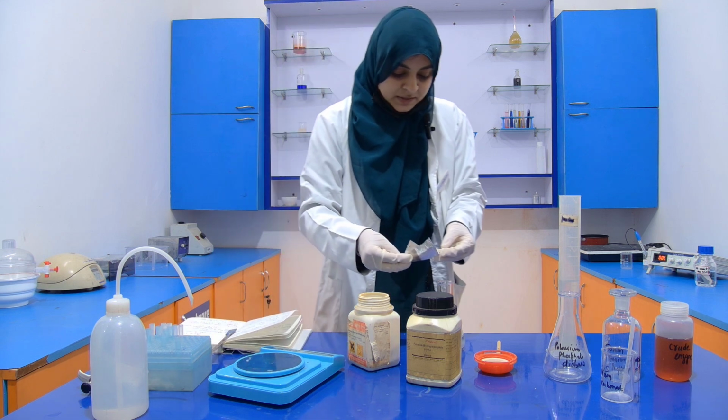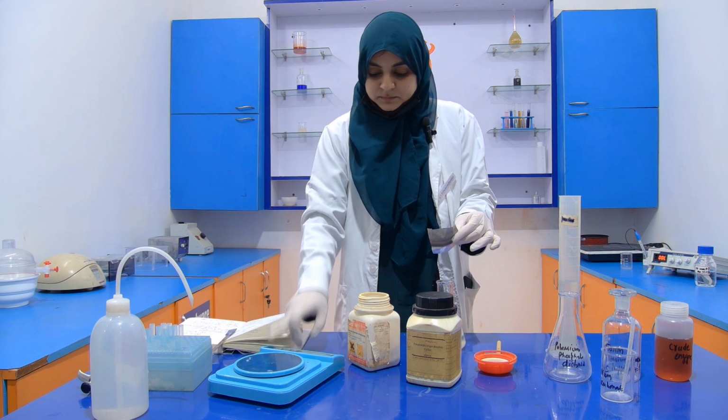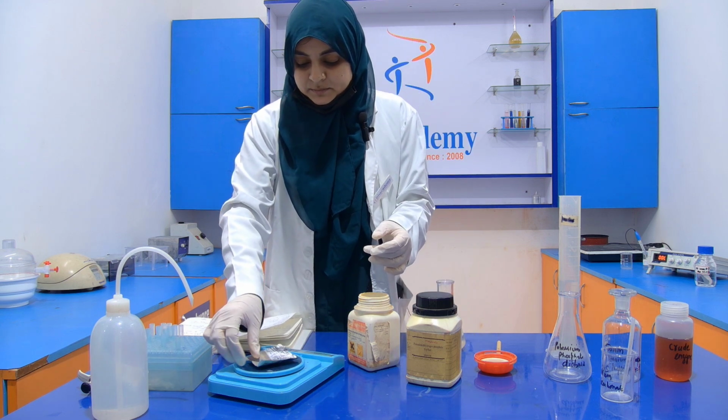Now dissolve this 10 gram into distilled water. Again take 10 gram.